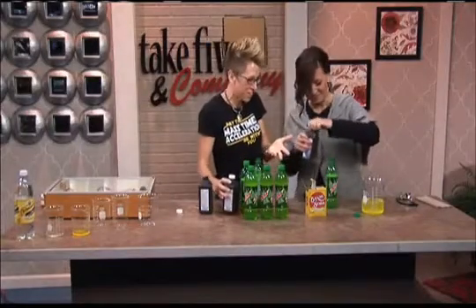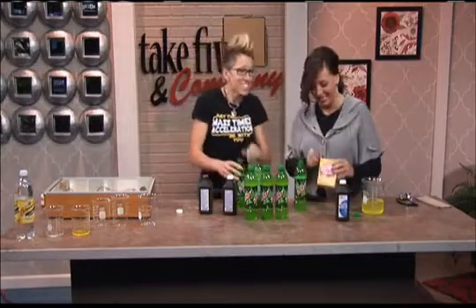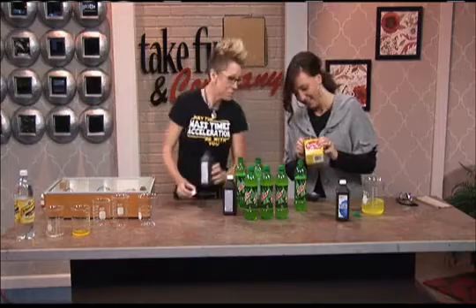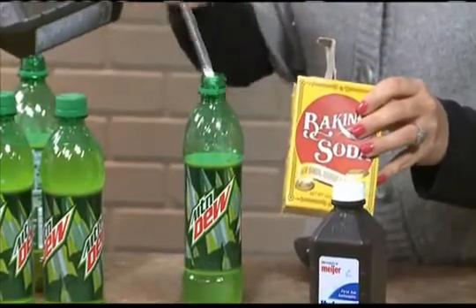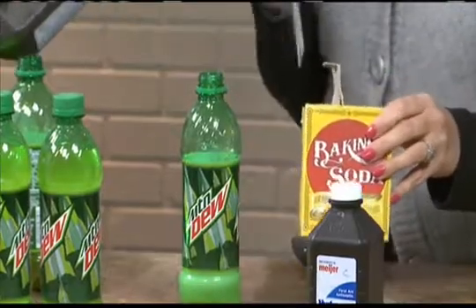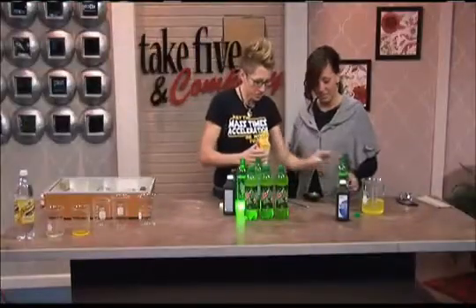Could we drink this after we get it to glow? Who knows? And then you add just a small amount of sodium bicarbonate, which is baking soda. After you add that to your mixture, you're going to mix it up, shake it up.